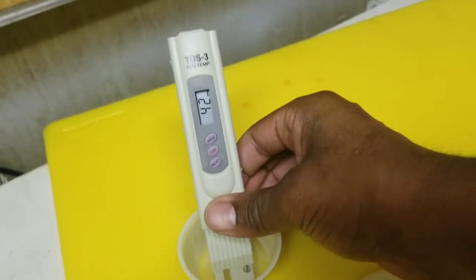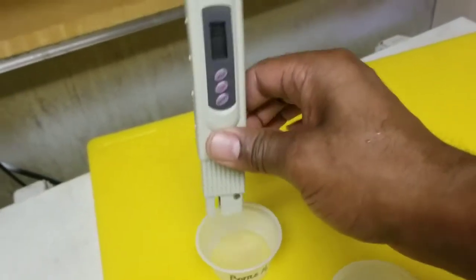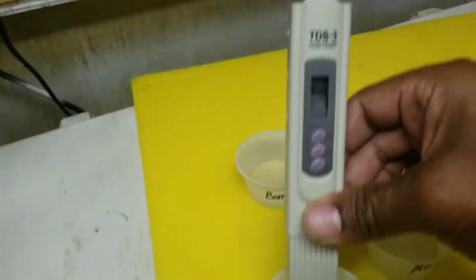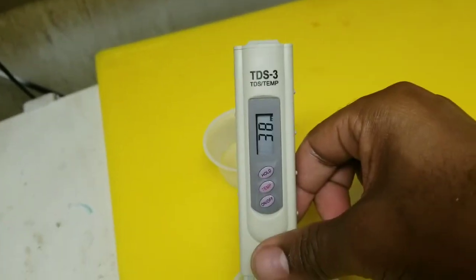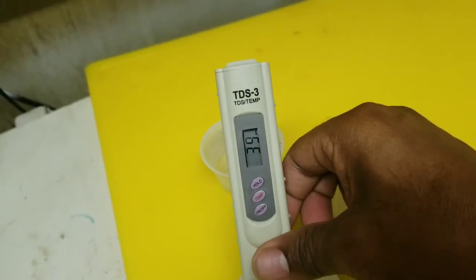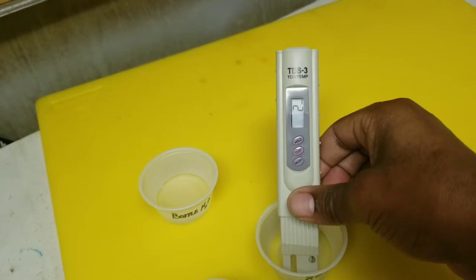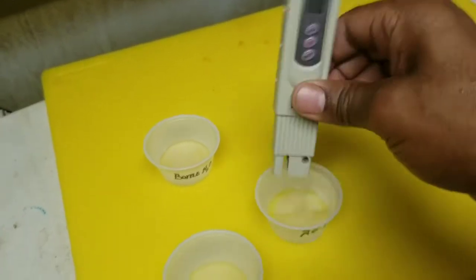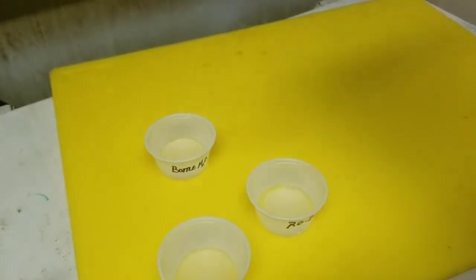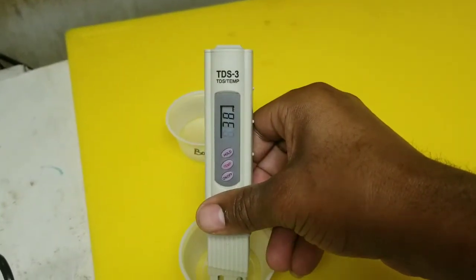Let's face it, many of us are buying bottled water because we believe it's better than drinking the tap water. But the tap water has less dissolved solids than the bottled water. And there's your experiment. RODI 2. And we're double checking it. You'll see I'm dipping it in, I'm shaking it between each to verify that the number is consistent.